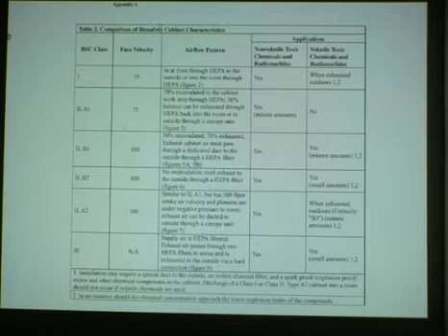Now here is the comparison of biosafety cabinet characteristics. The BSC class, whether it is class 1 and then class 2, type A1 or B1 or B2 or A2, and finally biosafety class 3. The face velocity for class 1 and class 2 type A1 is 75.